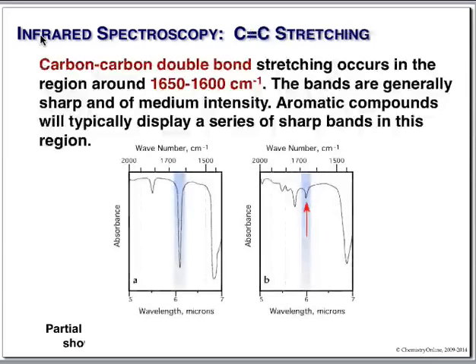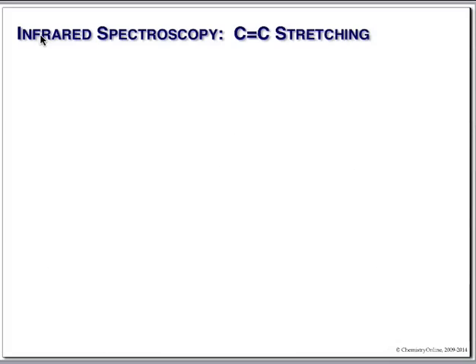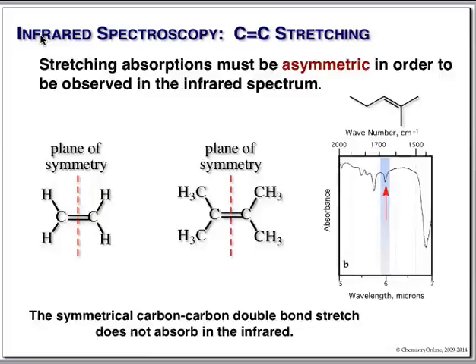Carbon-carbon stretch. We have the same problem with symmetry that we did with alkynes. Here we have a nice terminal alkene, again about 1650 or so, nice peak. This guy, we have carbons all the way around, and it's just an ugly little peak. Same sort of problem here. This is pseudosymmetric. Here we would have no absorbance. We would have no absorbance at all. This guy, we have pseudosymmetry, and we have this little tiny lump. Depending on what's attached to your alkene, you can either see it or not.